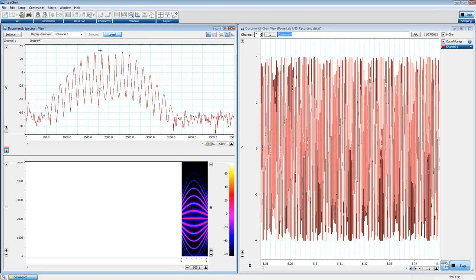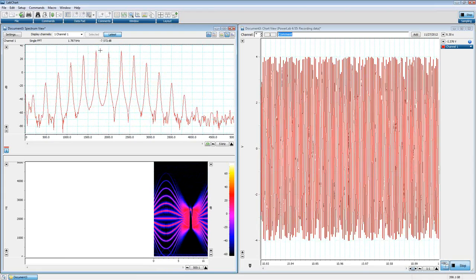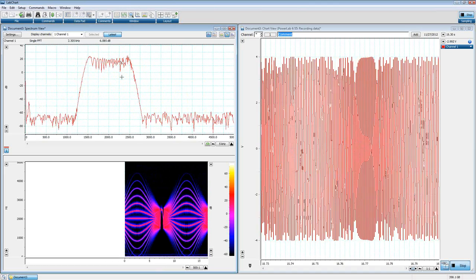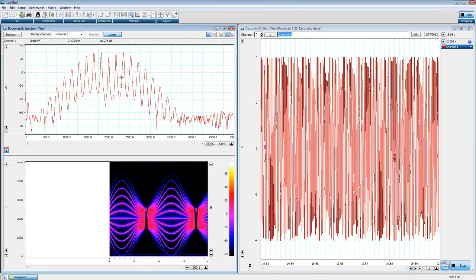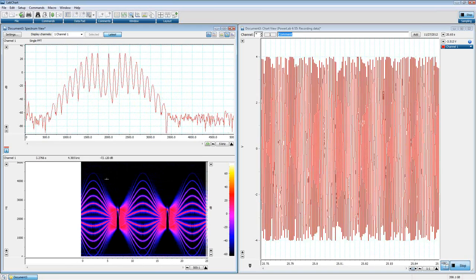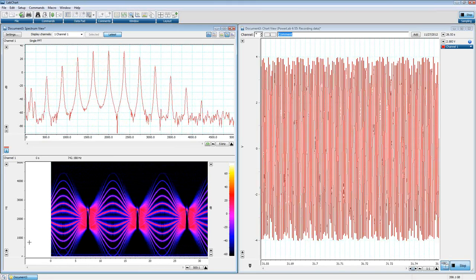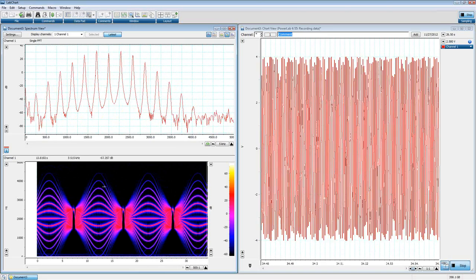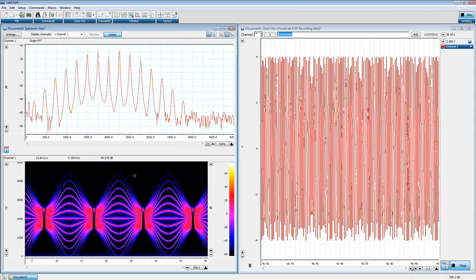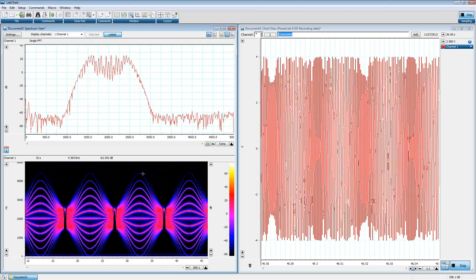So you can see here, we have actually developing different frequencies within the wave that we're outputting, and it's oscillating back and forth. We also have our pretty color spectrogram down here telling us how things are changing over time as we're recording. So we have different harmonics, and like I said, again, they go into 1, and we start spreading out again, or different combinations of sine waves coming together, and they're oscillating according to time.